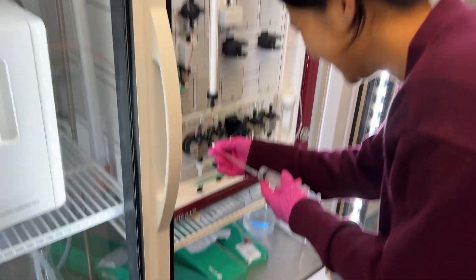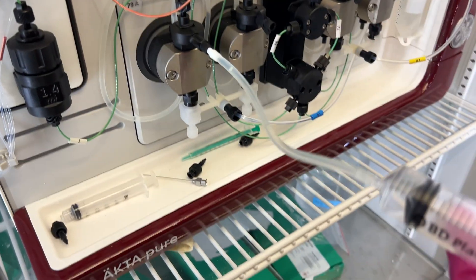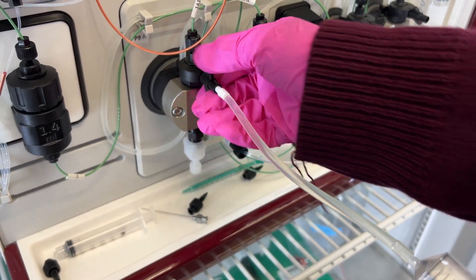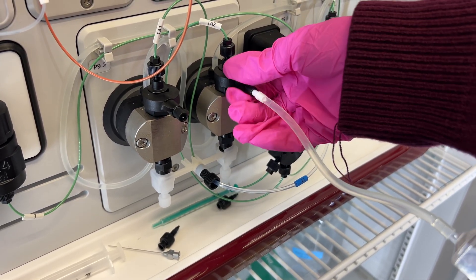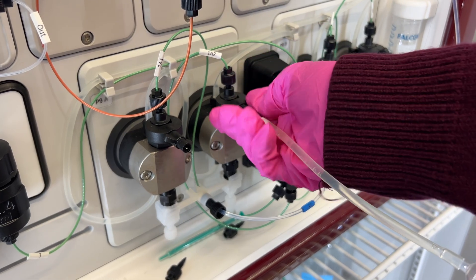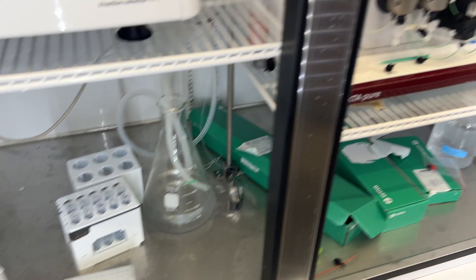Alice is now going to demonstrate priming the pump. She's going to stick the tubing directly into the black port, turn to the left, and gently pull out — you can see the liquid flowing nicely. She'll now twist that back to the right and tighten it up, then go into the other pump head, turn it to the left, pull out there, then close that back up. You can just squirt the waste liquid into the waste container.